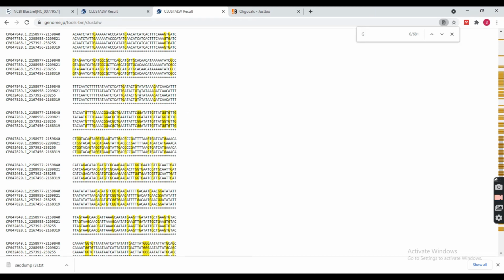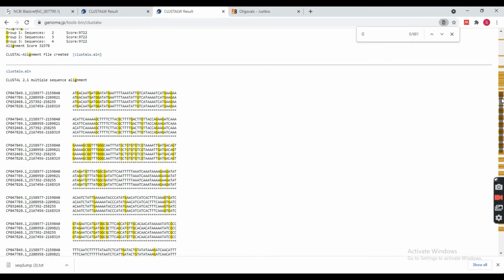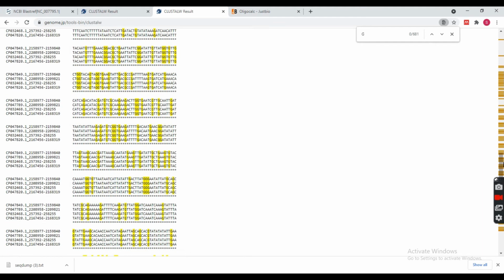Alright, so in that case, one reason might be that you have not chosen the direct or correct orientation. You may have selected plus minus sequence as well. You should avoid that. In another case, if that has happened, then you must choose the sequence from the first or the last, because there will be a gap of nucleotide and it will be good for your primer designing.